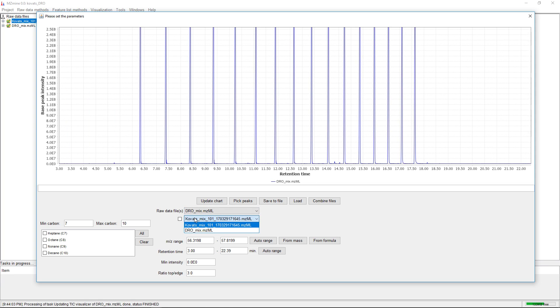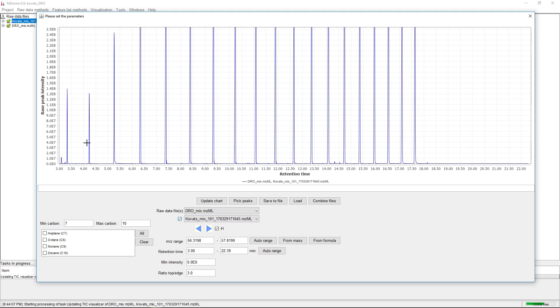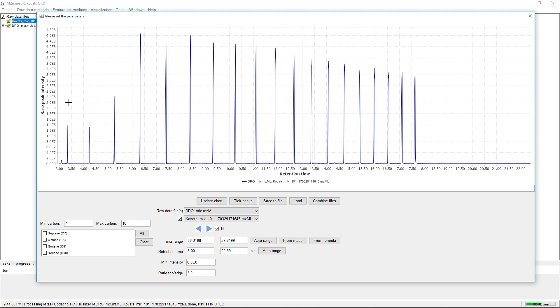We can also add a second sample. We use two samples here to pick the different peaks and the retention times of the different standards.